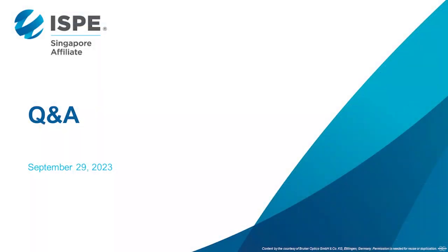Okay, thank you, Mario. So actually, there's another question coming from another guest. Sure. He or she asked, how can we find the library spectrum? So I guess he's asking, where do you find the library spectrum? Probably is it from Bruker, or do they have to create their own library? And the second question the person has is, and how about the confidence level the library spectrum is used for comparison?